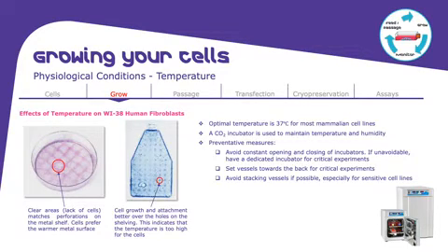So try to avoid any kind of extreme temperatures or extreme CO2 levels. Make sure that you are controlling your incubators as well, because when cells are under stress, you will probably get a wrong response from them when you do any kind of manipulations for your assays later on.